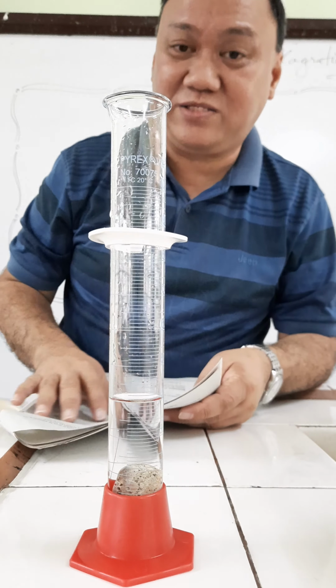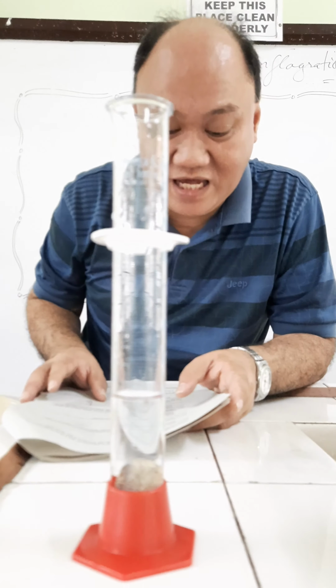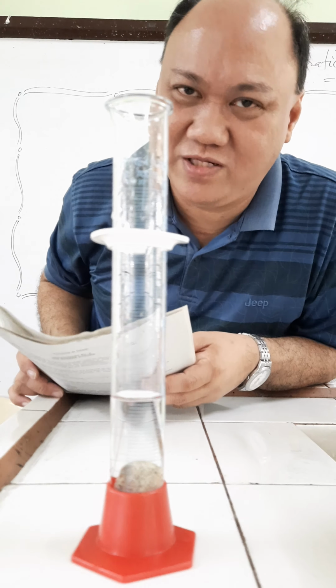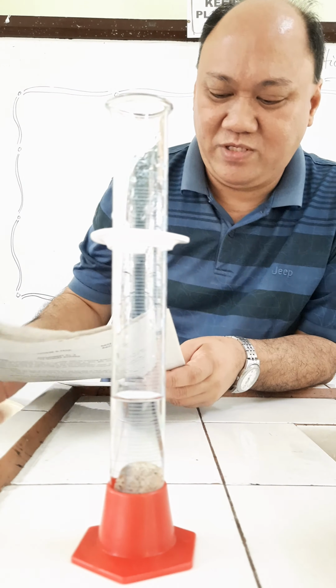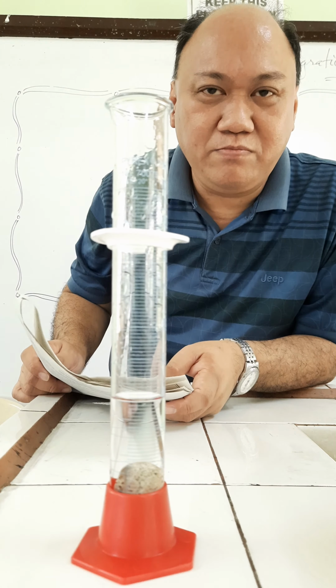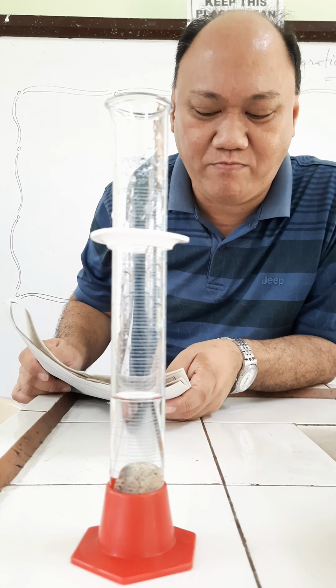Initial reading, 30 ml. Now, our final reading is 40 ml. Try to do a very simple arithmetic and you will know the volume of the pebble inserted into this graduated cylinder. So that ends procedure number 2. Now let's proceed to procedure number 3.